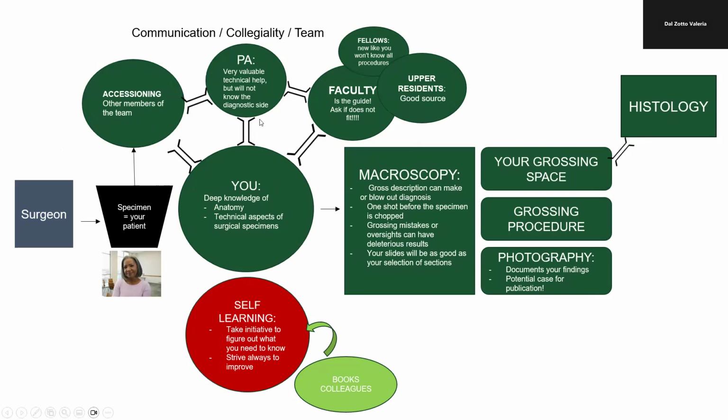We interact with a complex social and technical environment, so you need to know your players, your team. First of all, you are going to interact with the surgeon, sometimes indirectly, but many times directly, especially during the frozen room mornings.